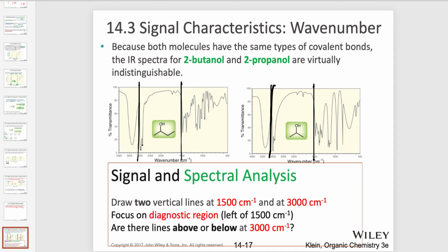And I see something similar here. So this is for your carbon-hydrogen, so you can make a note of that as you're entering it into your Cornell note-taking modules. And then we also have a very broad one here, and these are actually very easily characterized, and these are typically OH bonds. So remember, all the bonds to hydrogen are high or to the left of the IR spectrum. So here we have the OH.